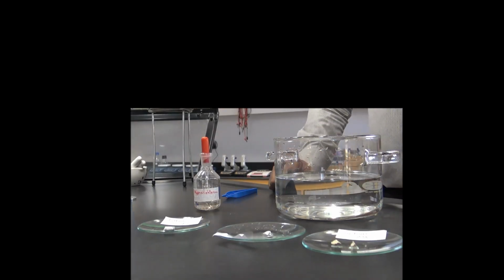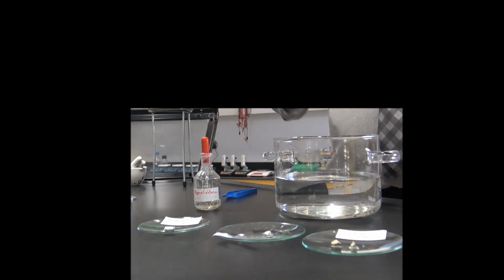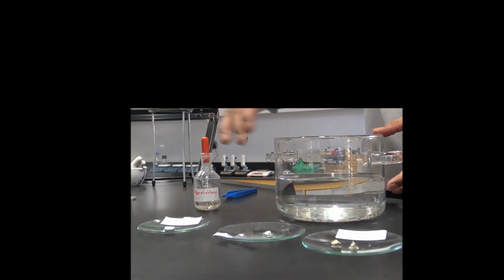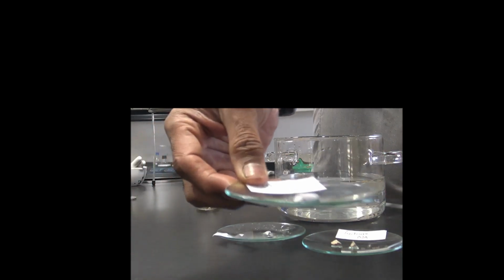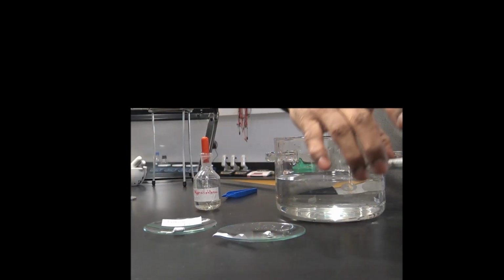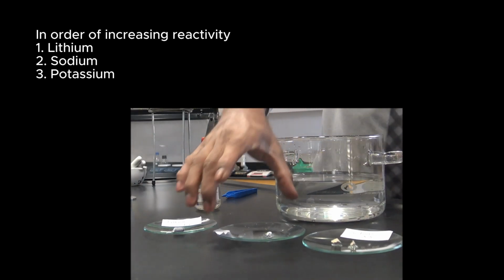Hi guys, we are looking at the metals of group number 1, which are called alkali metals, and we are trying to see their reactivity across the periods. We have group 1 metals, of course, starting from lithium, and you can see this is a lithium metal we have taken here. Then we have the next element in the group, which is sodium. You can see that's sodium here, and the third metal after sodium we have potassium.